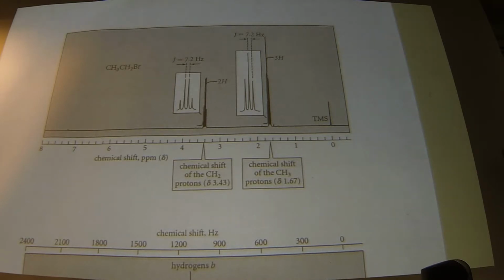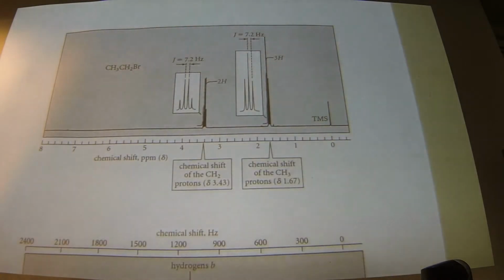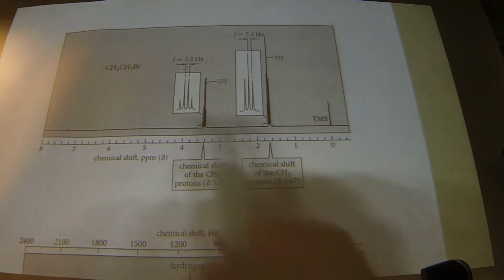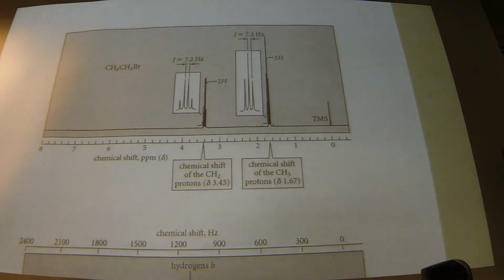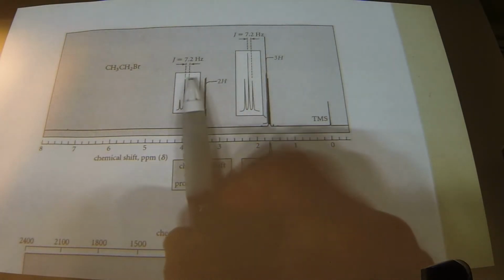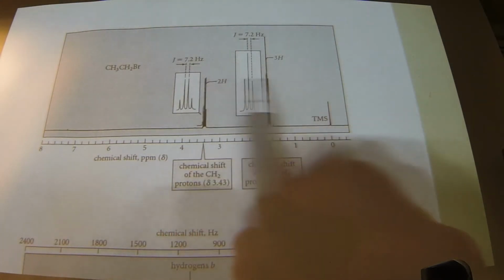Okay, because just imagine that we have a much more complicated spectrum. We've got a triplet here, and a quartet here, and a quintet here, and something else. I want to know, well, okay, I see splitting all over the place, but which ones are coupled to each other? And the way you know is because the coupling constant, that splitting, is identical only for peaks that are coupled. Now, it can be accidentally the same too, and that complicates things. But for simple things, it's a safe bet that if the spacing is the same, then they are coupled.